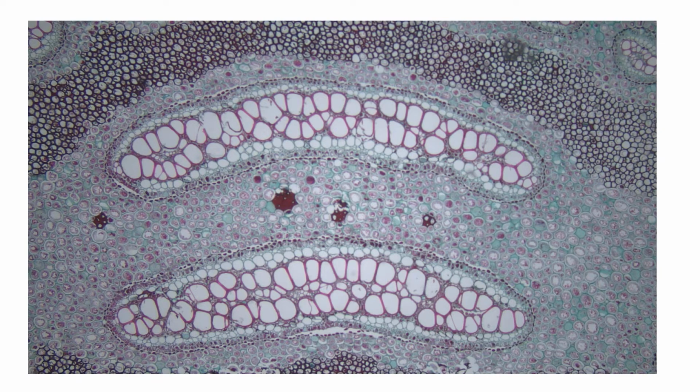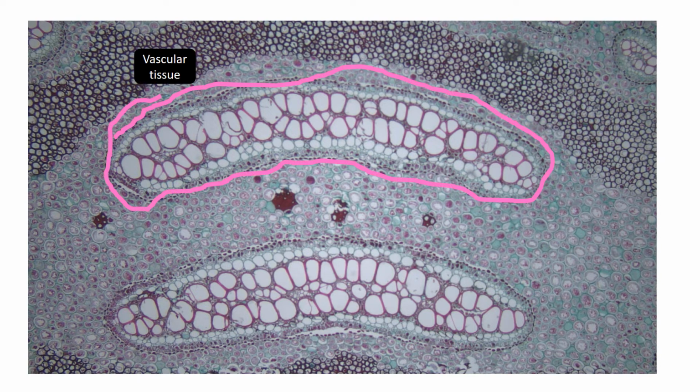Wouldn't be right if we didn't start off with ferns. Ferns. Here's an example of a fern rhizome. There's a lot of things happening here. It looks kind of scary. A lot of creepy circles, a lot of weird things happening. What even is life? But nevertheless, this is what we're looking for.